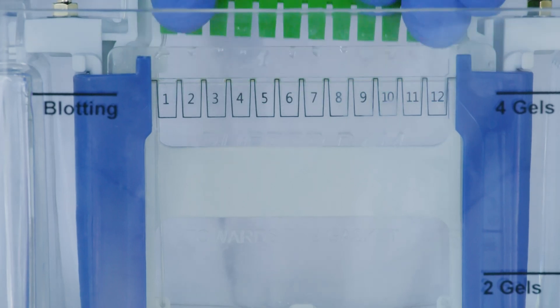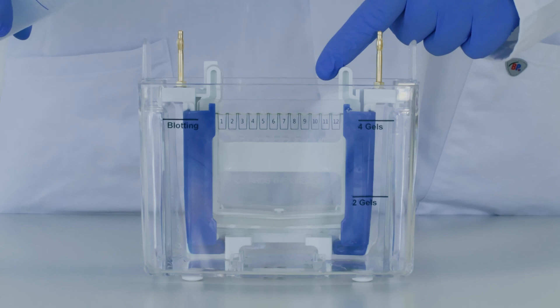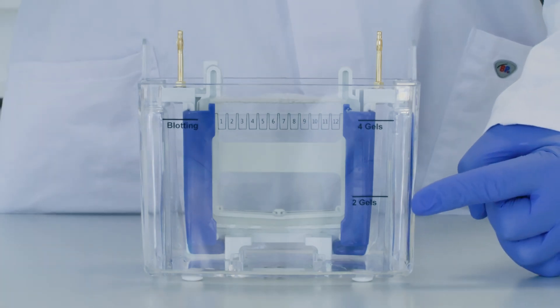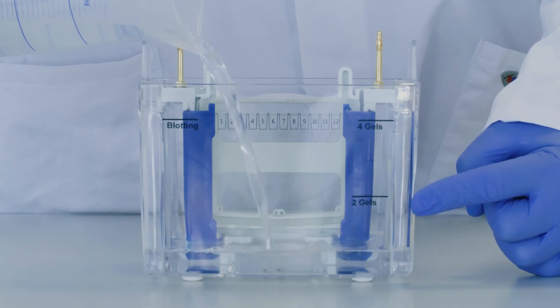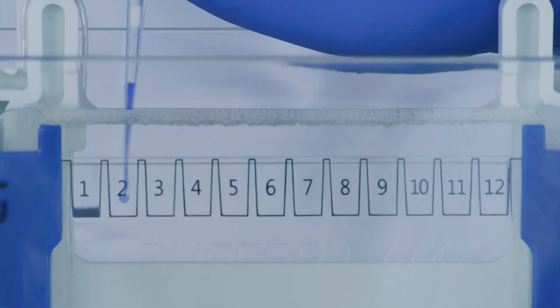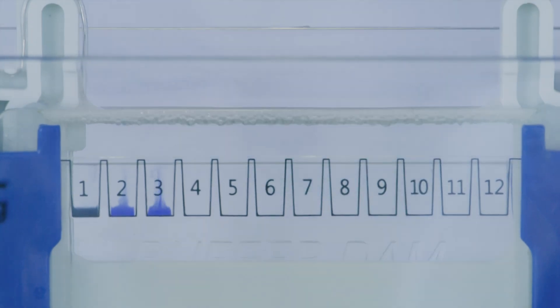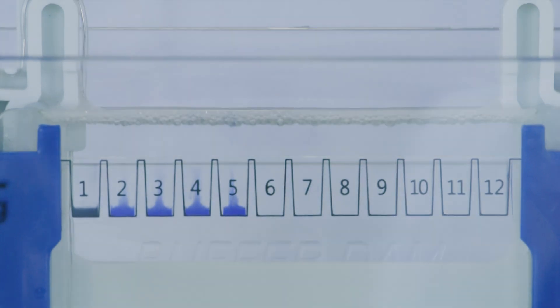Remove the comb from the GIL. Slowly pour the previously prepared running buffer into the inner electrophoresis chamber and fill it completely. Then pour the running buffer into the chamber tank, filling it up to the appropriate mark when using two or four GILs. Load the samples into the sample wells, making sure to inject the sample slowly and let it sink from the pipette tip down to the bottom of the well.